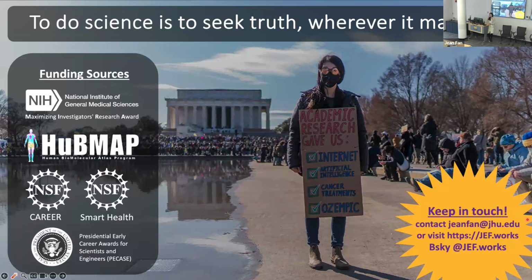The chart, I think about the Xenium versus the recent chart. You did the comparison using the average count, right? So to say some genes are entirely this way. Would that be more drastic if you use it more density-based, considering how each pixel is represented differently? Because, for example, the top B1, you totally convinced me that one is totally different. It would probably pop up into a different corner.